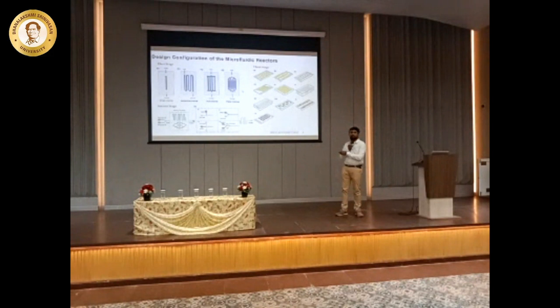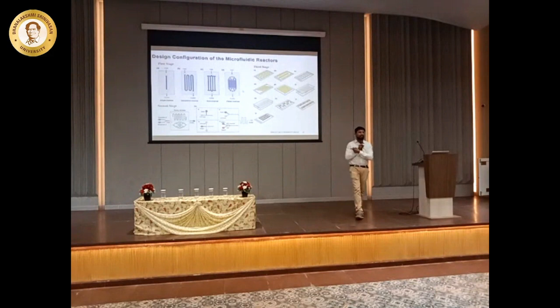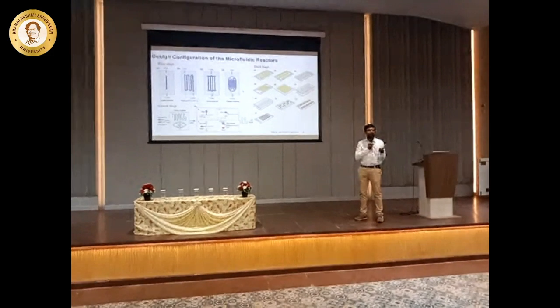At these points, the two liquids will flow through this. Because it has to bend, it will hit on the surface of the walls. And again, the diffusion takes place within this U channel. And then it mixes. And that is where, instead of our beaker, we are changing the magnetic stirrer with the serpentine structures. Because we have these magnetic stirrers, right? We put magnetic beads into it and we stir it. I don't want to put a magnetic bead. I'll add this simple U bend channel, or we call it serpentine structures. I mix it. So mixing can happen this way, right?